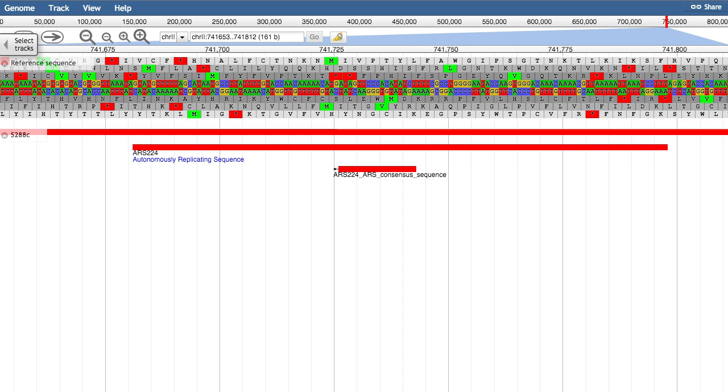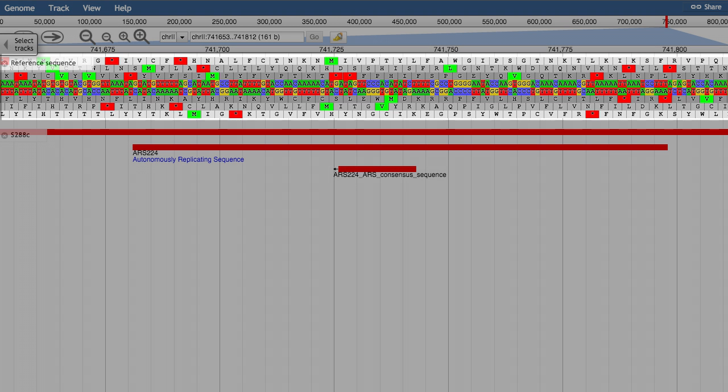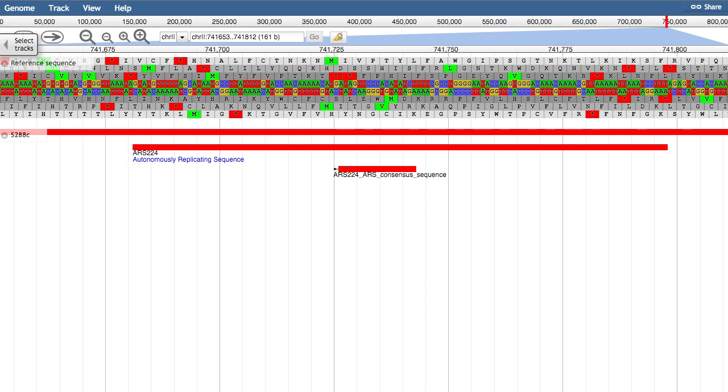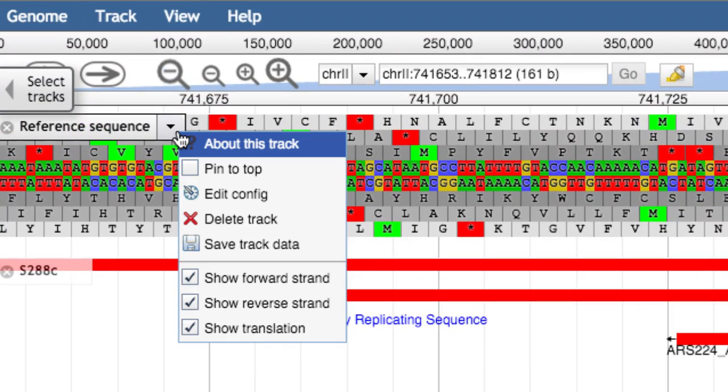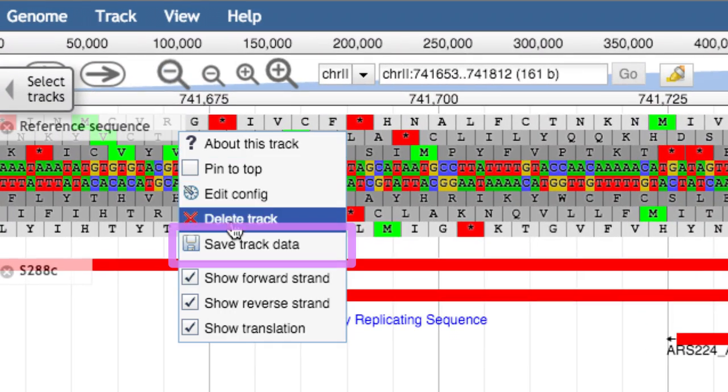First, you can download the sequence of the region currently in view by opening up the Reference Sequence Data Track menu and selecting Save Track Data.